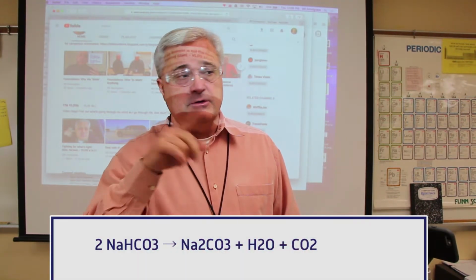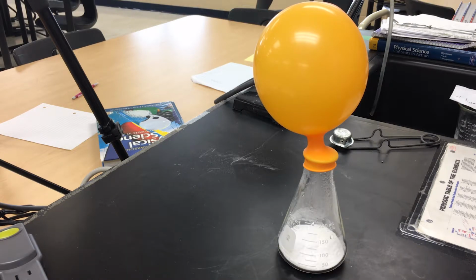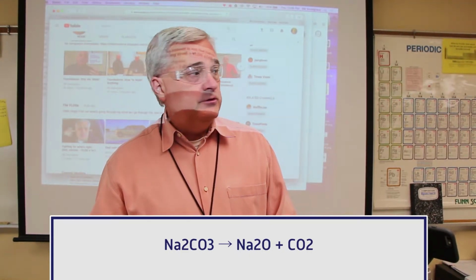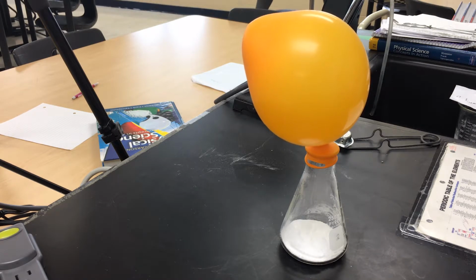The complete, balanced chemical reaction is down in the notes also. It's been in the overscreen. Here it is again. So you can see what the balanced chemical equation is. You can see that water and carbon dioxide are both products. The sodium carbonate that is formed also decomposes, and that reaction looks like this. So it also decomposes and produces more carbon dioxide. So as the thing cools down, even though the air is cooling down inside the system, the balloon continues to expand because carbon dioxide is being produced.